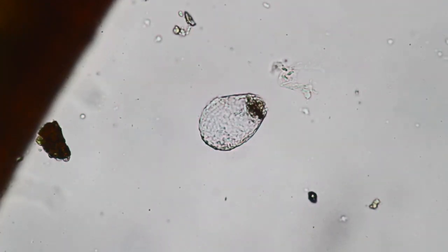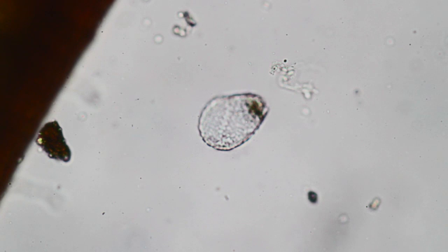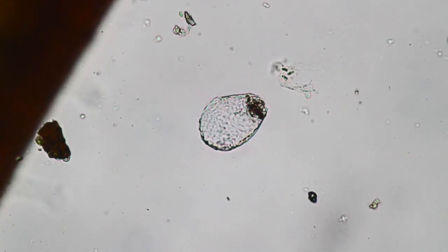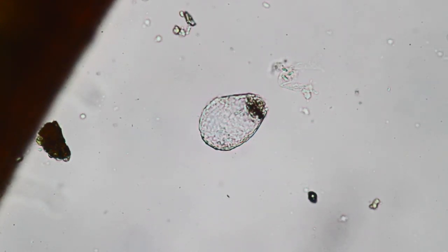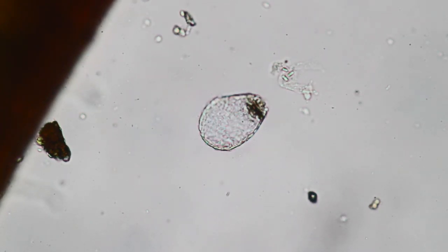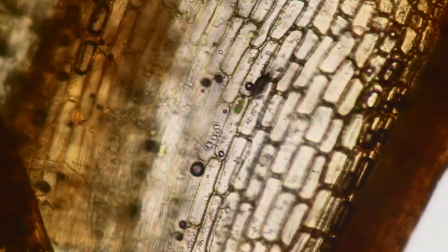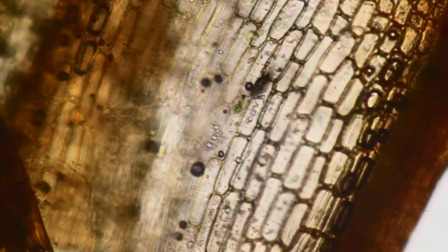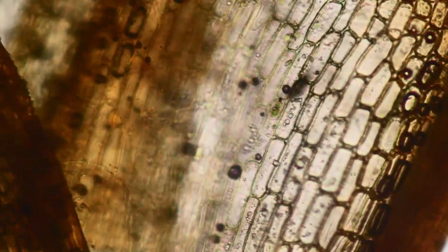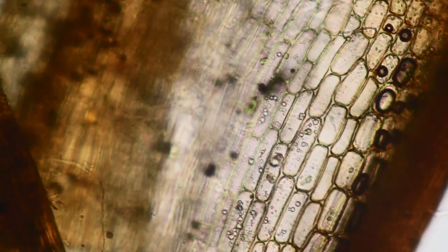This looks like the shell of a so-called testate amoeba. These amoeba are single-celled organisms and some of them have a shell. It looks rather similar to one of these shells — I'm not sure if it is one, but it could be. It looks rather empty. Otherwise, also here there is not much of interest. Over here is the moss — it looks rather dead because it's not green. This way we can see a little bit better the individual cell structure and the cell walls.